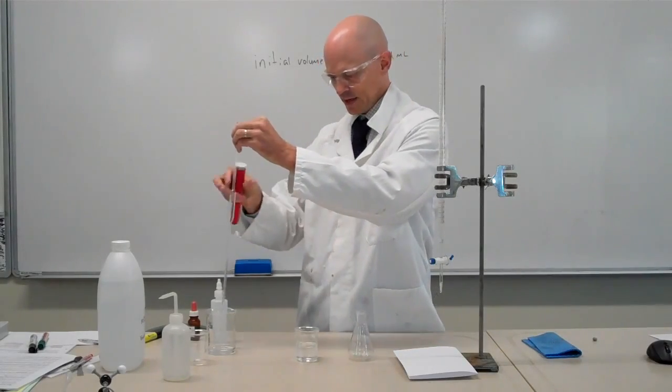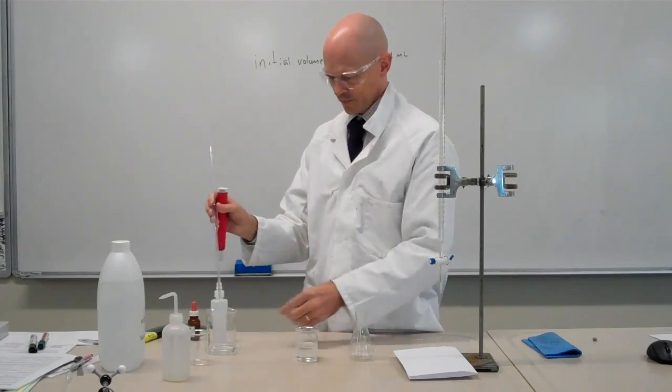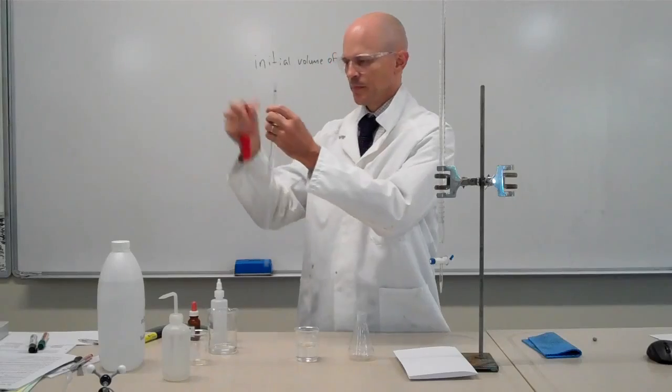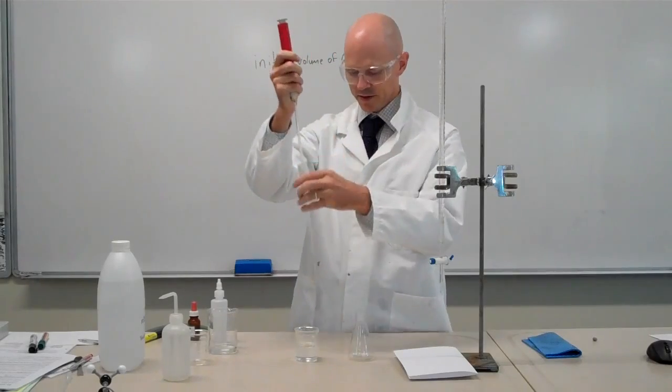Let the pipette drain out. Just touch to the side of the beaker to draw the last couple of drops. And it's ready to go.